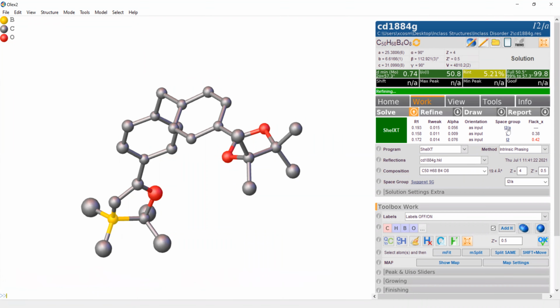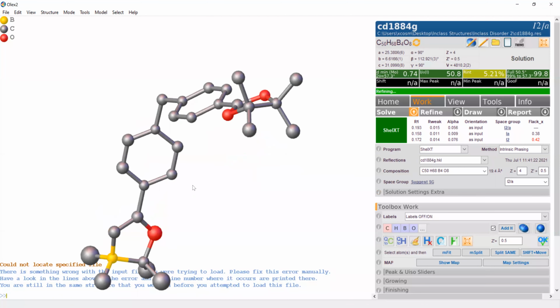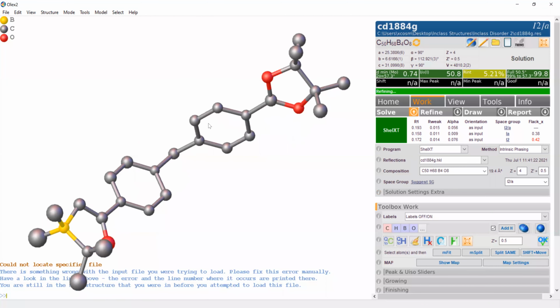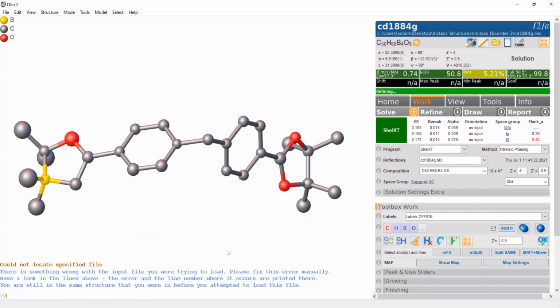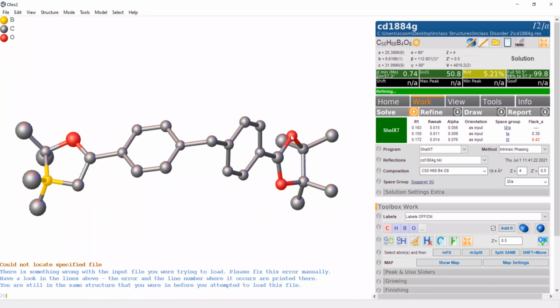So here I2/a is our space group. Now it has boron, oxygen, and carbon. And so I didn't give you a picture of what this structure looks like, but the oxygen's here. And here are the correct positions. So there should be 2 oxygen atoms here, and we should see also 2 oxygen atoms here and here. So if I was to give you a proposed structure, these 2 positions should be oxygen atoms.